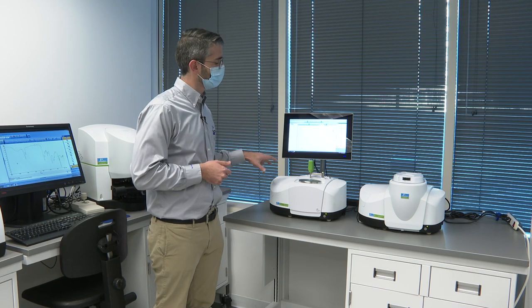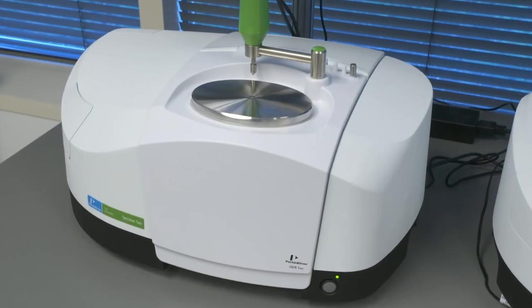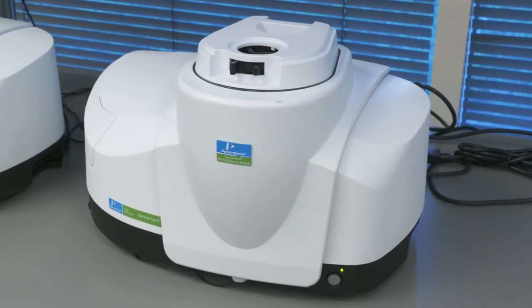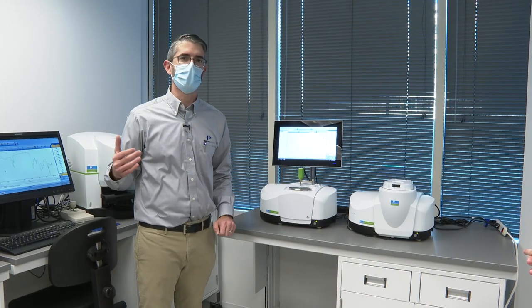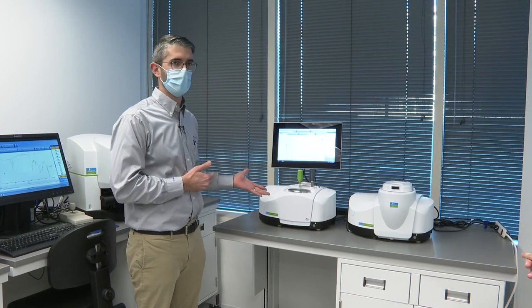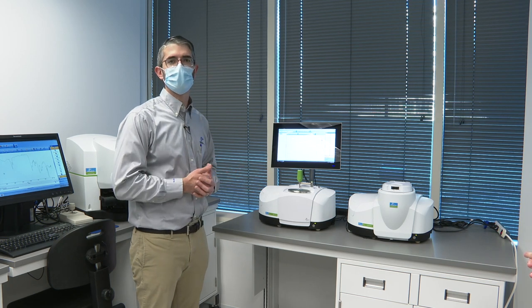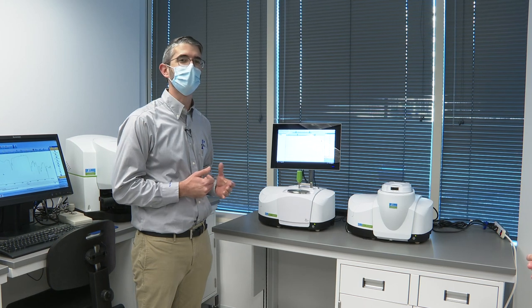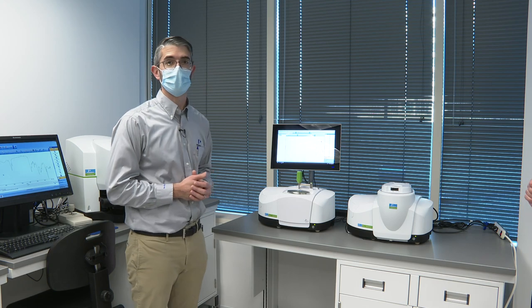These instruments are available in dedicated single range formats. The Spectrum 2 performs measurements in the mid-infrared spectral range and the Spectrum 2N performs measurements in the near-infrared range. Both of these instruments, as well as our other FTIR instruments, are compatible with our own PerkinElmer branded sampling accessories. We've also partnered with several third-party vendors to make a wider range of sampling accessories available so that these instruments can meet any variety of analytical challenges.